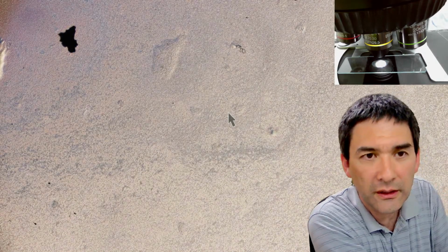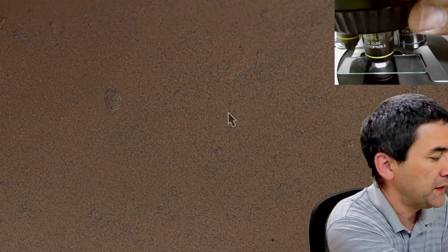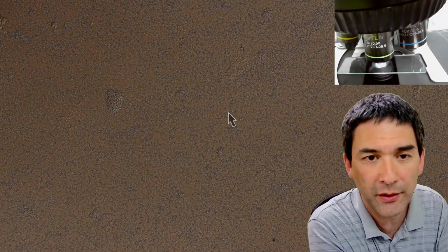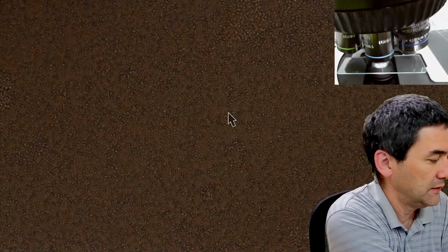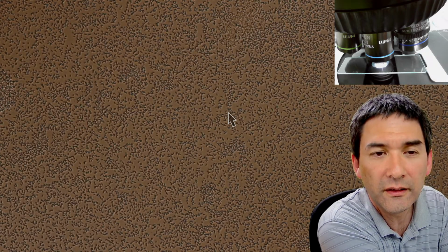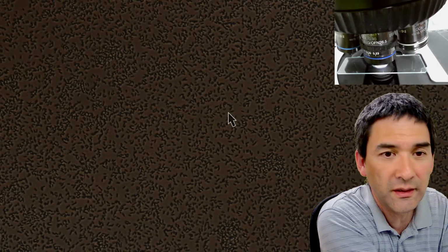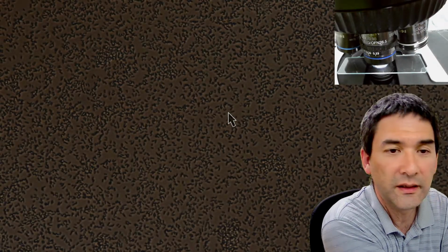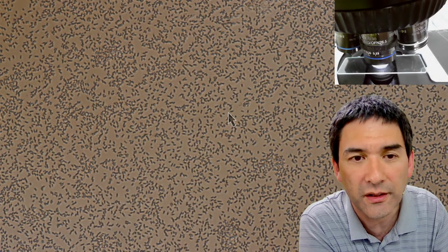Okay, here we go. It's still quite dense here. Let's go up with the magnification. No cover glass, by the way. Okay, no cover glass. Yeah, and I think you get the idea, now 60 times. Let's open it a little bit. This is actually much better to see.